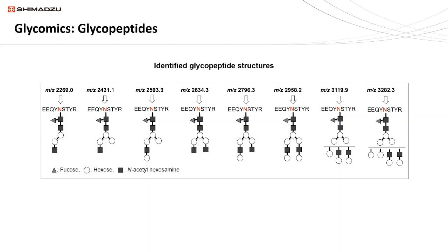And so due to the heterogeneity of most oligosaccharides, it can be difficult to determine what their structure are because it's not known from the genome. And so to be able to identify them and understand how that structure relates to the function of the molecules is very important. And so this can be a useful tool for anybody that wants to study glycomics.